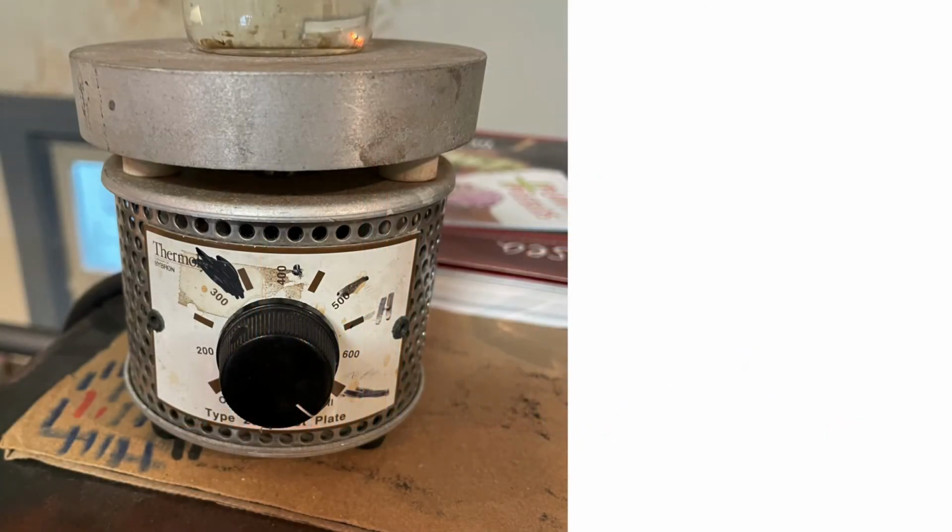So, what is the quick and dirty way to look at these microcharacters? Well, first, you either have fresh material or you need to soak in water. Or basically you have to boil your dry herbarium specimens, the flowers that is, in order to see them.